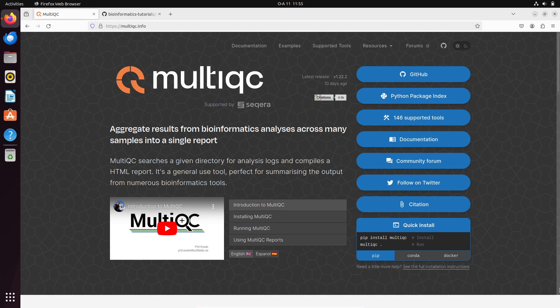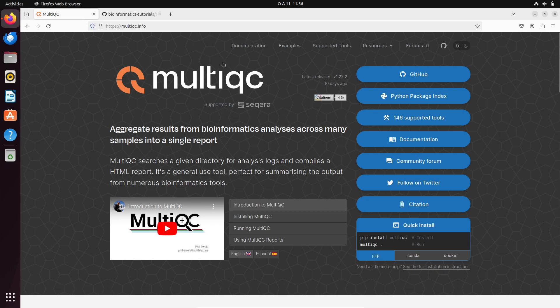Hi everyone, welcome to the Bioinformatics Code channel. In this video I'm going to show you how to install and set up MultiQC on a Linux system. For those who don't know, MultiQC is a tool that allows you to aggregate output from different bioinformatics tools into a single report. You can check the documentation and the software developer's page for more information.